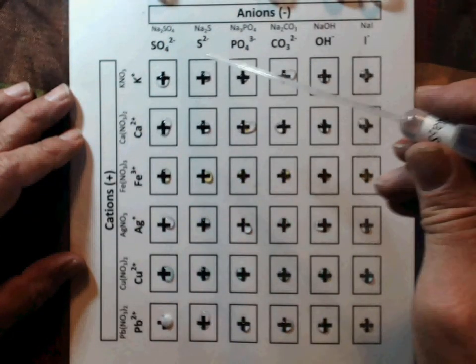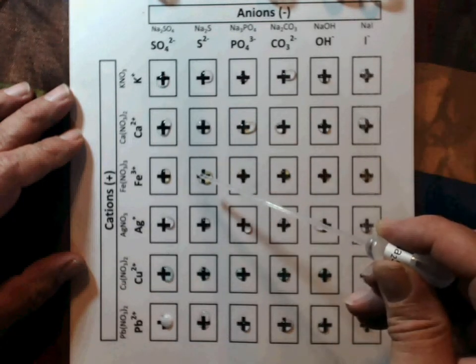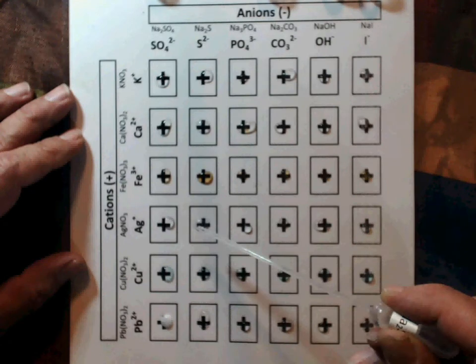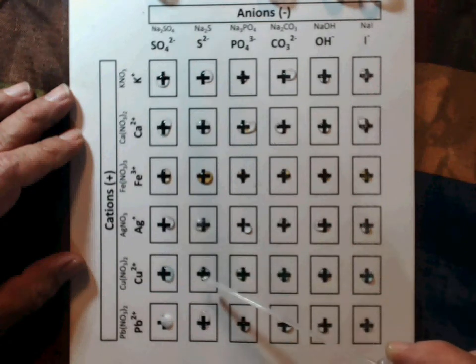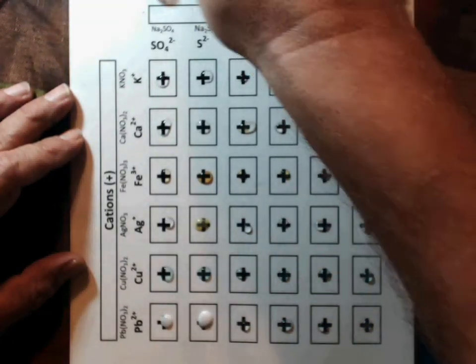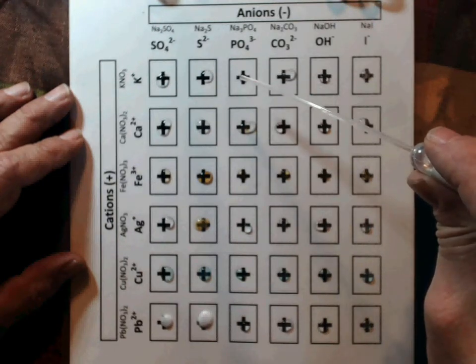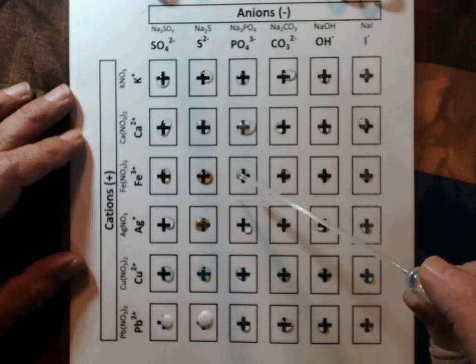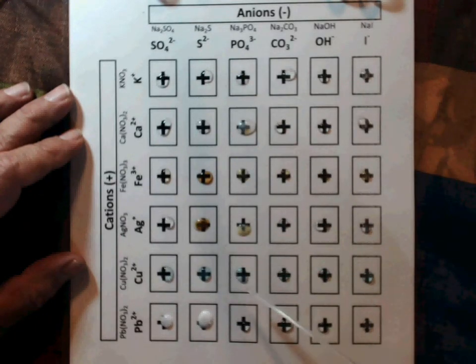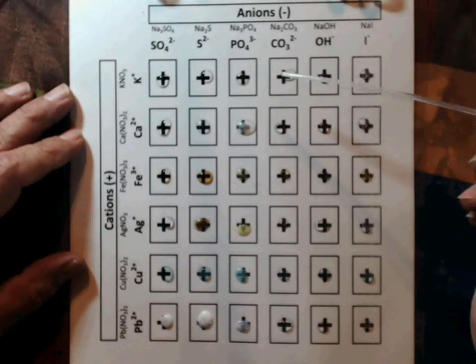Next we'll do the sulfide. Next, the phosphate. This is the carbonate.